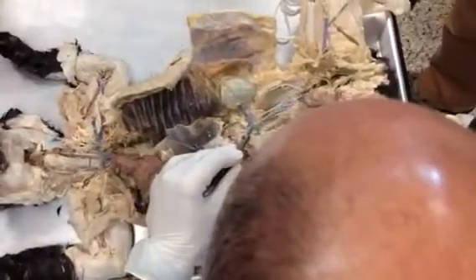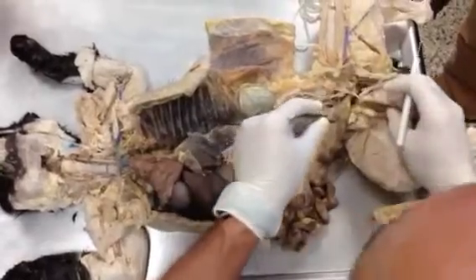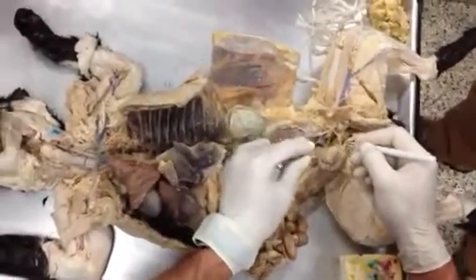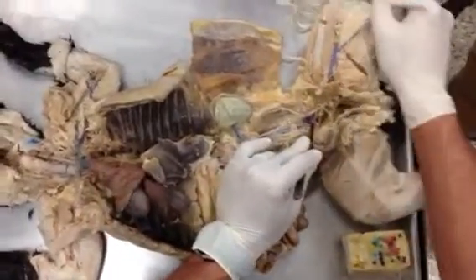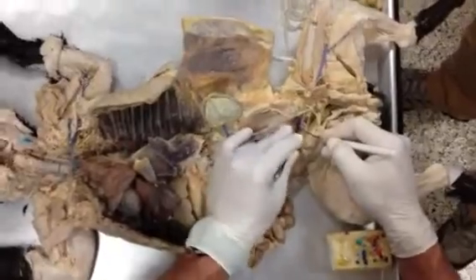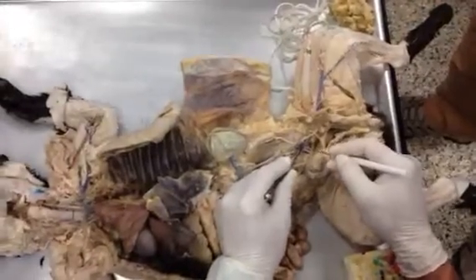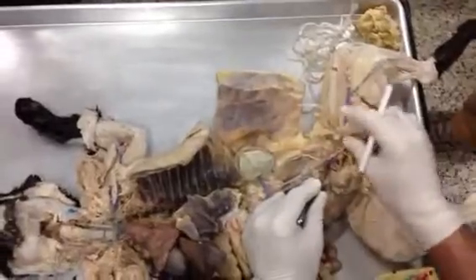So we continue on. There's my inferior vena cava running down. And now here, it bifurcates in the body cavity. We had broken up the male reproductive system here so that we can see. And the branching right there branches towards the left leg and the right leg, and we're going to call that the common iliac right there. That splits into the internal and the external. So there is my left common iliac in the body cavity. In the body cavity. Right?